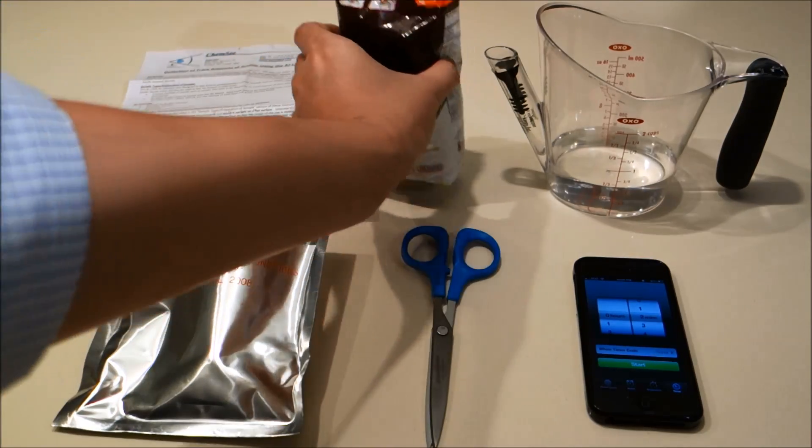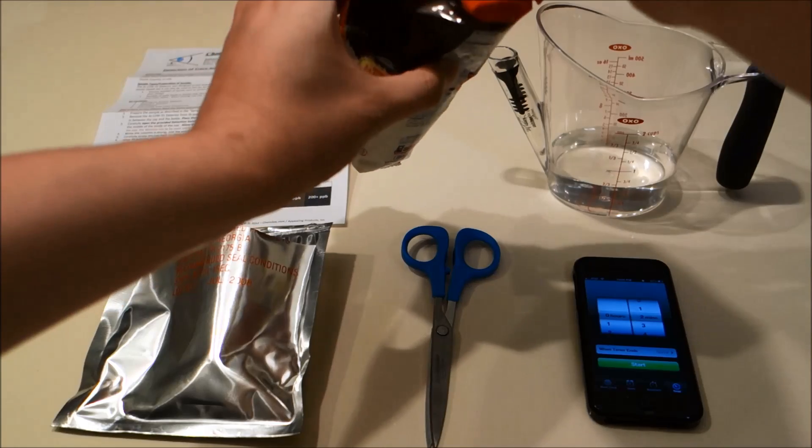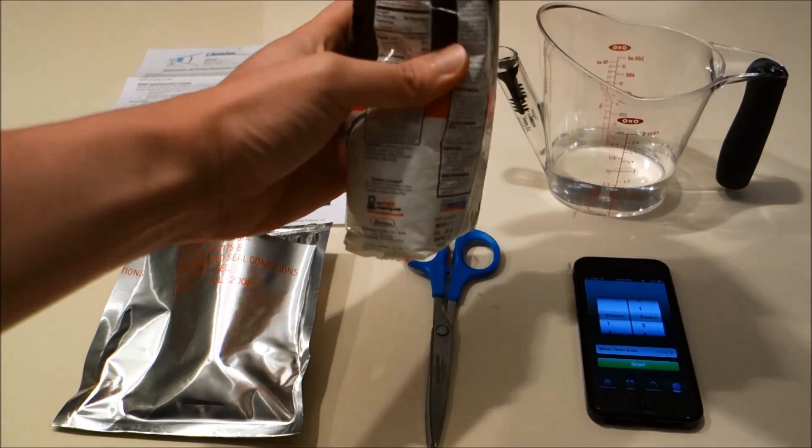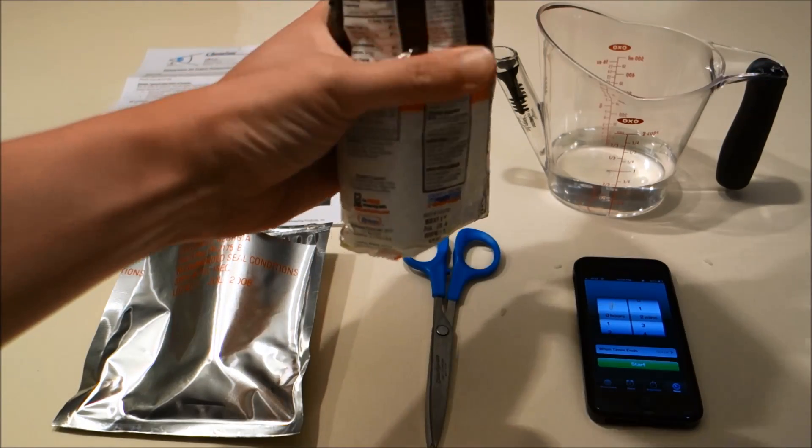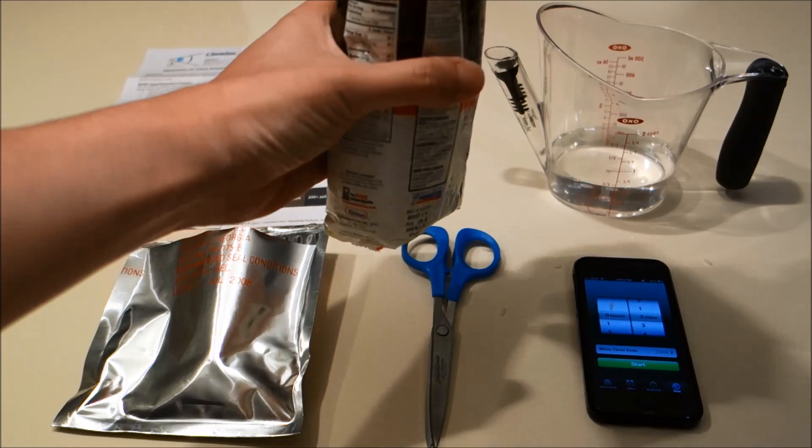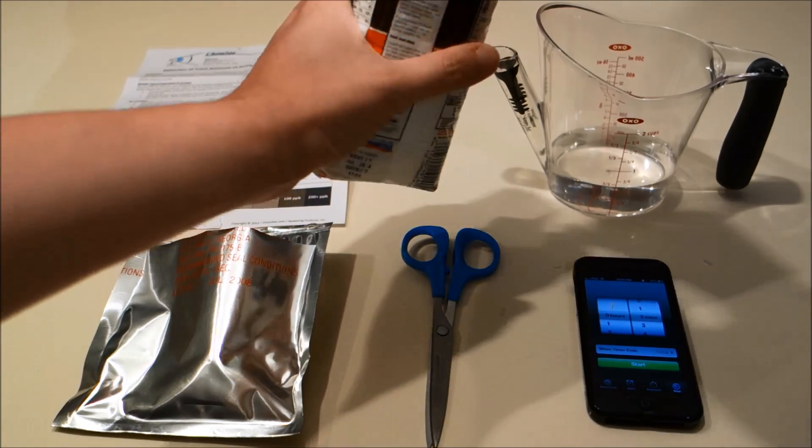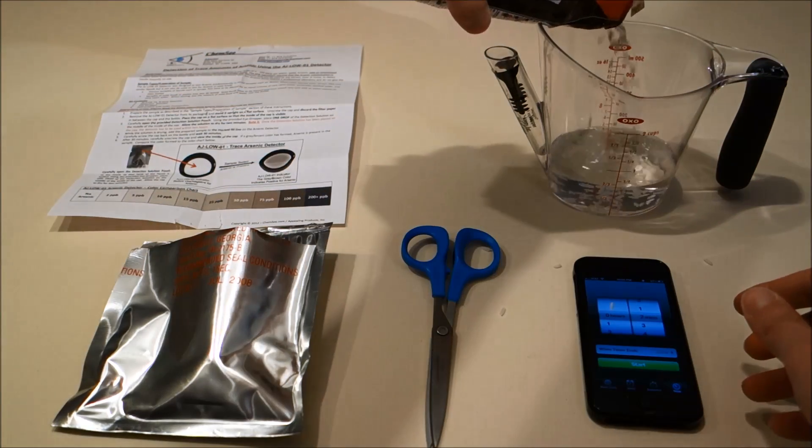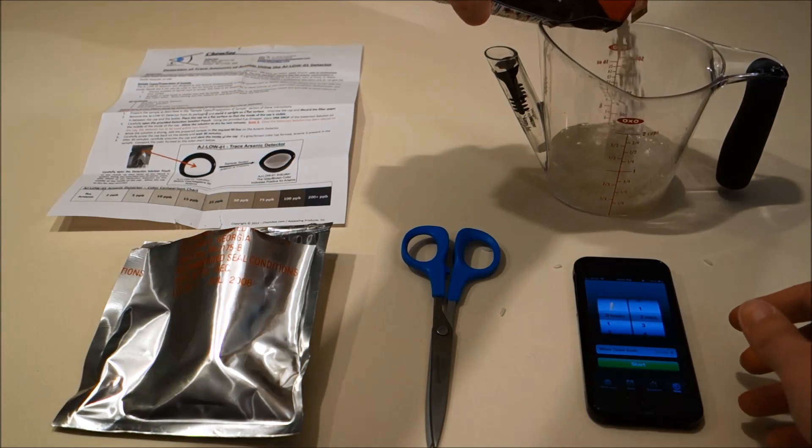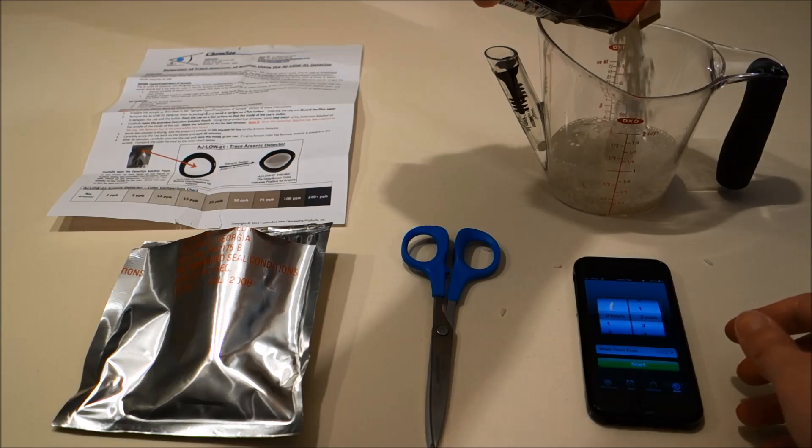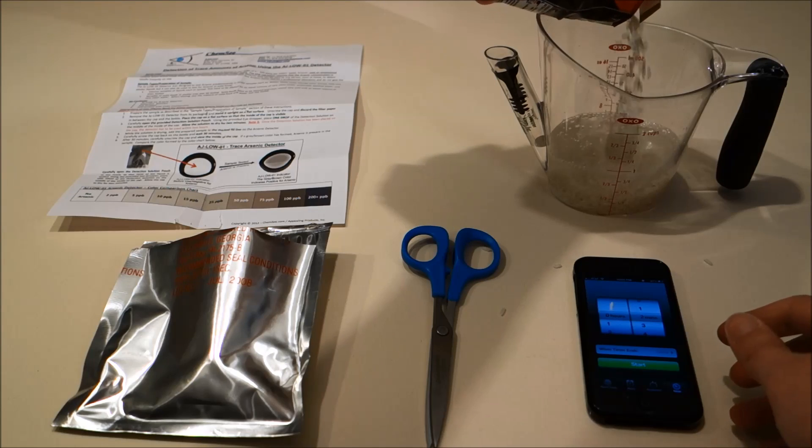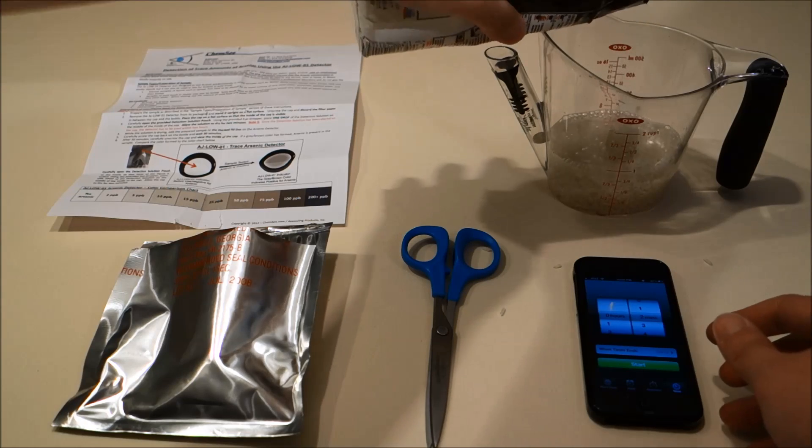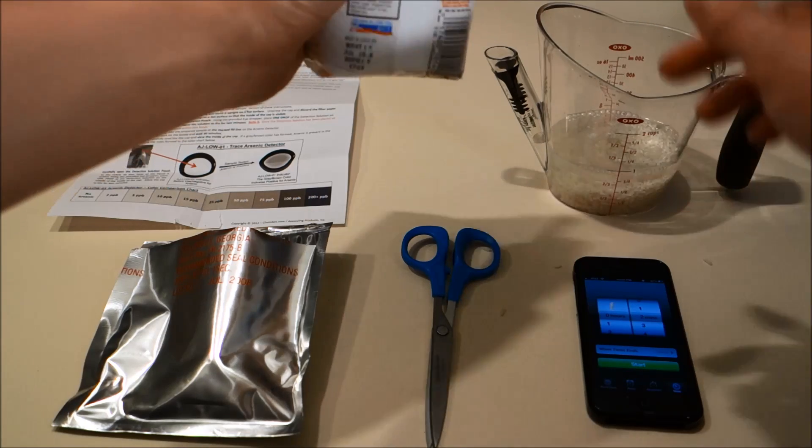So we're going to take this rice sample, open it, and mix about a quarter cup into our water. And let that sit for about two minutes.